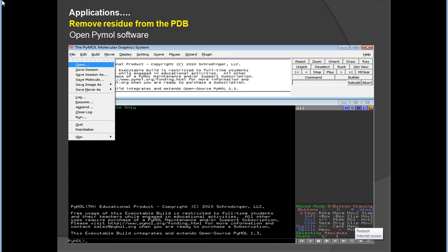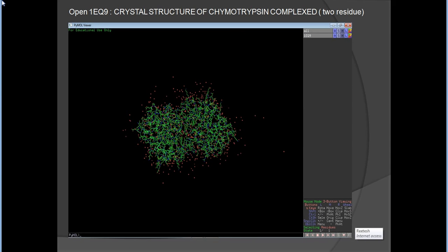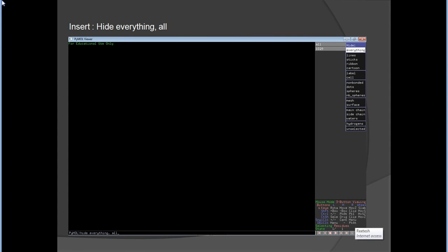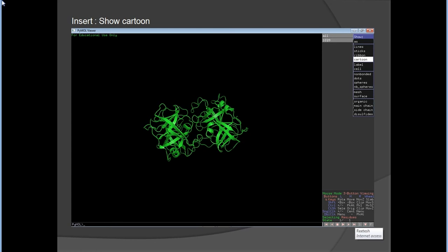From an application point of view, you can go to File and Open. For example, I have already downloaded one PDB file — 1EQ9 — from the Protein Data Bank. This is the crystal structure of chymotrypsin. After opening, you just hide everything: go to H for hide and select everything, or input 'hide everything, all'.